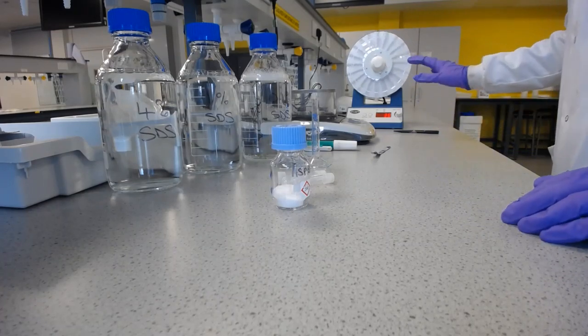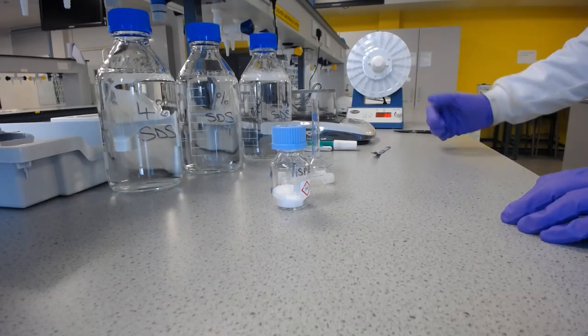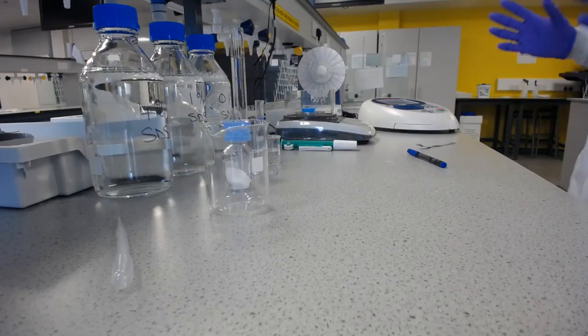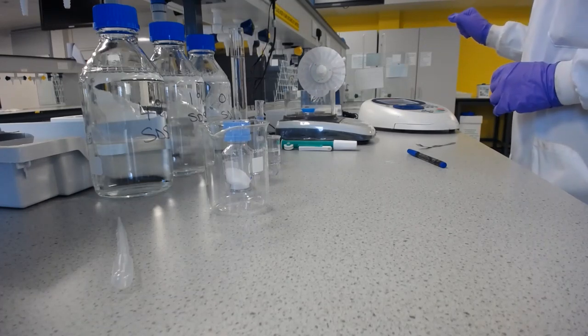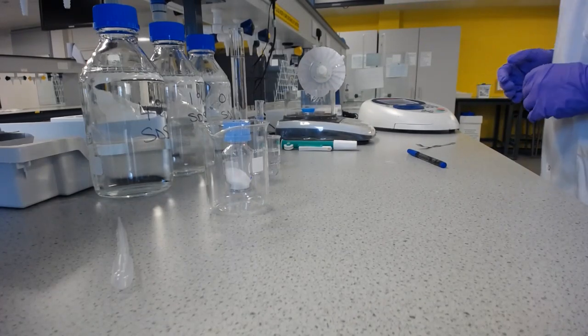And then whilst they're going around, I'll then go through with you how we're going to make the calibration curve to measure how much aspirin's in each of these solutions afterwards. I now have all 4 solutions rotating there, so they're being agitated and mixed. So that's with water, 0.1, 1 and 4% sodium dodecyl-sulfate.